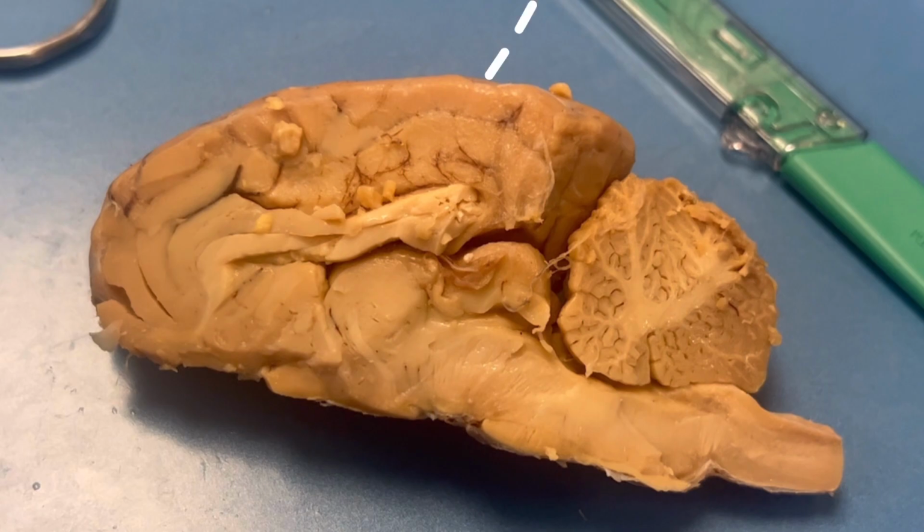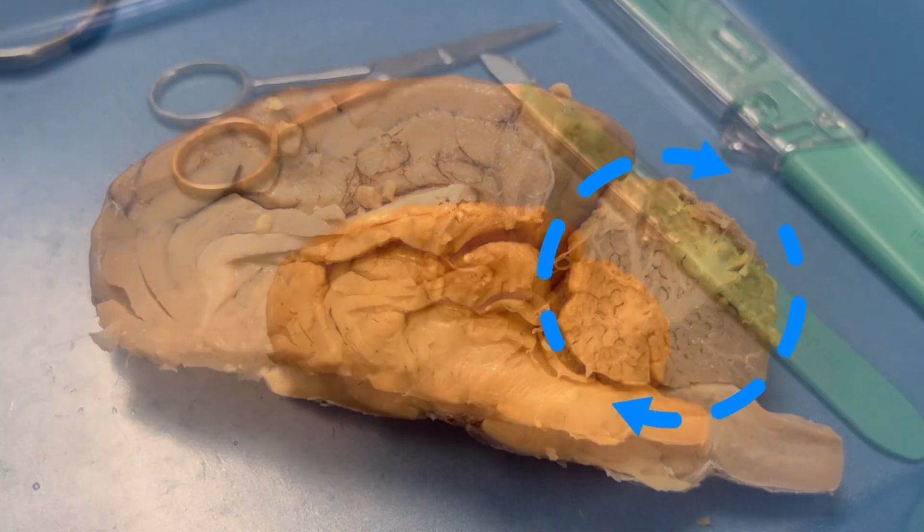Here we can observe the cingulate gyrus, the corpus callosum, the lateral ventricle, fornix, the third ventricle, pineal gland, the optic chiasm and nerve, the thalamus and the hypothalamus, the mammillary body, the fourth ventricle, the cross-section of the midbrain, which includes the superior colliculus and the inferior colliculus, the cross-section of the pons, medulla oblongata, and the cerebellum.